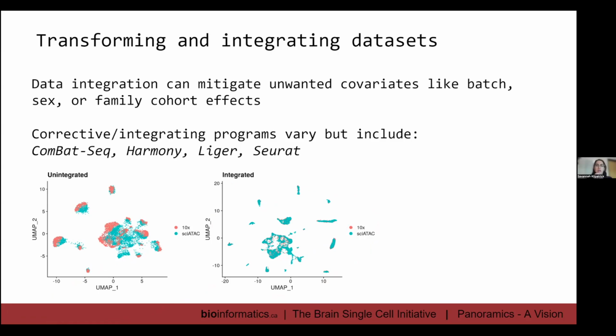If your data sets are lacking in the majority of the cell types that they're supposed to be producing, it may not be an appropriate way to analyze your data. And from a more computationally conservative manner, you can also just analyze two data sets separately and combine later. So that's just some food for thought.